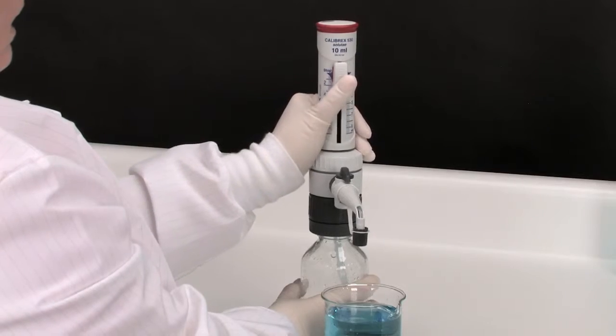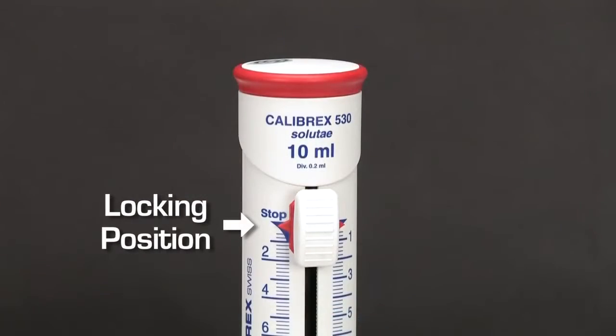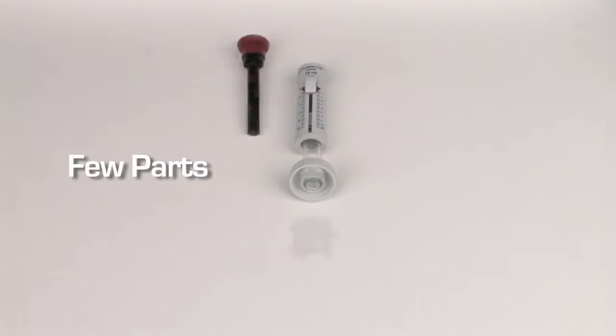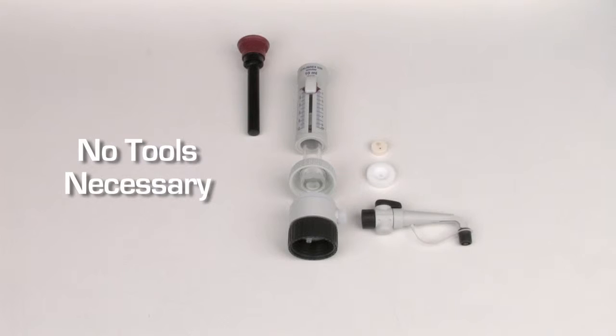Additional safety is provided by a range of locking positions. The dispenser is made of only a few parts, making it easy to disassemble, clean and reassemble with no tools required.